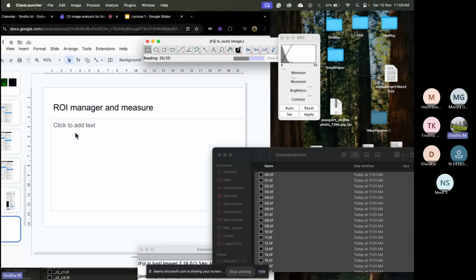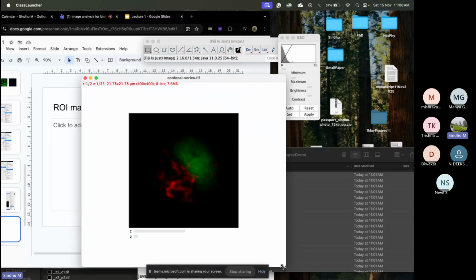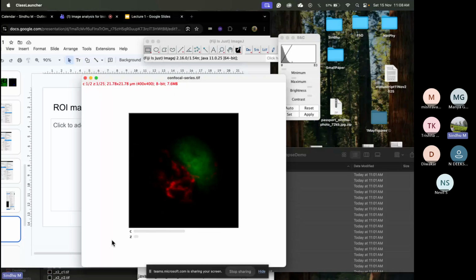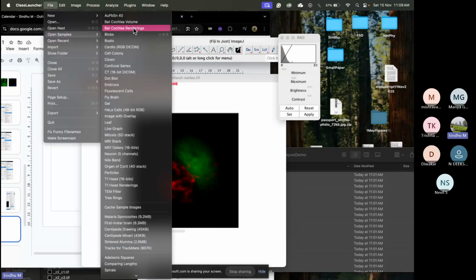You can use this if you want to measure the intensity values or the shape of a cell, etc. I think this would make sense if there are any sample images where the cells are visible nicely.